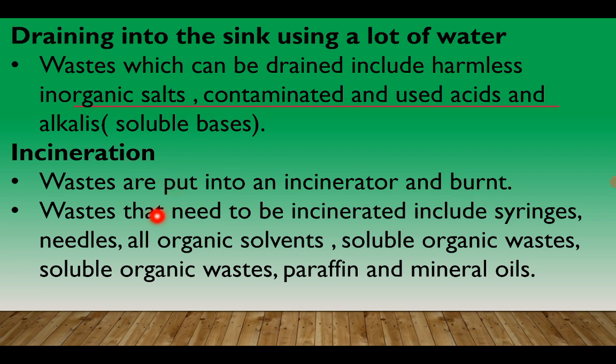So wastes that need to be incinerated include syringes. Syringes are basically, most of them, plastics, needles, or organic solvents. Examples of organic solvents include some organic acids, alkanones, and others. Soluble organic wastes.